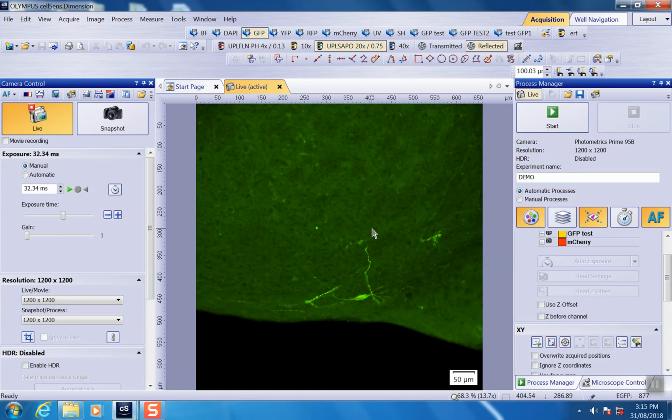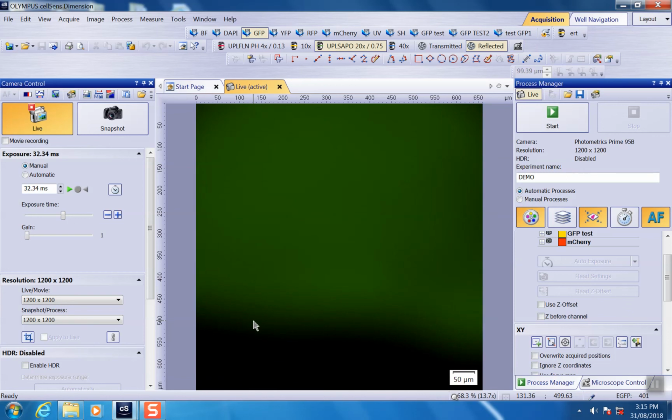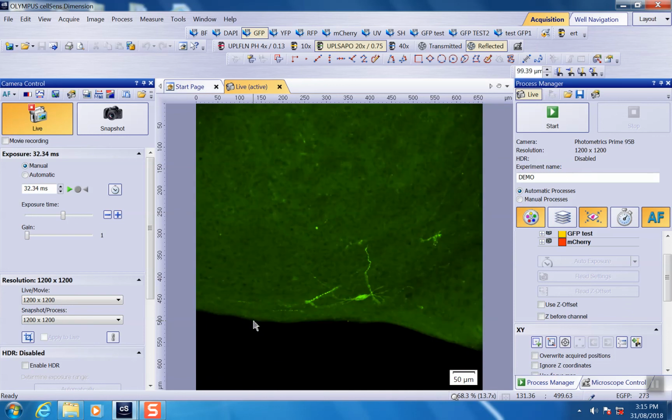So every time you move it around, as long as the carrier or the vessel's plane remains constant, the ZDC will find the glass and then add a certain offset number and find your focus plane. Let's see how it works. If we put it here and I ask the ZDC to find the offset, you can hear the ZDC beep once and register the offset at this number. It's essential for the ZDC to work with the offset. If you don't have an offset, the ZDC cannot work.